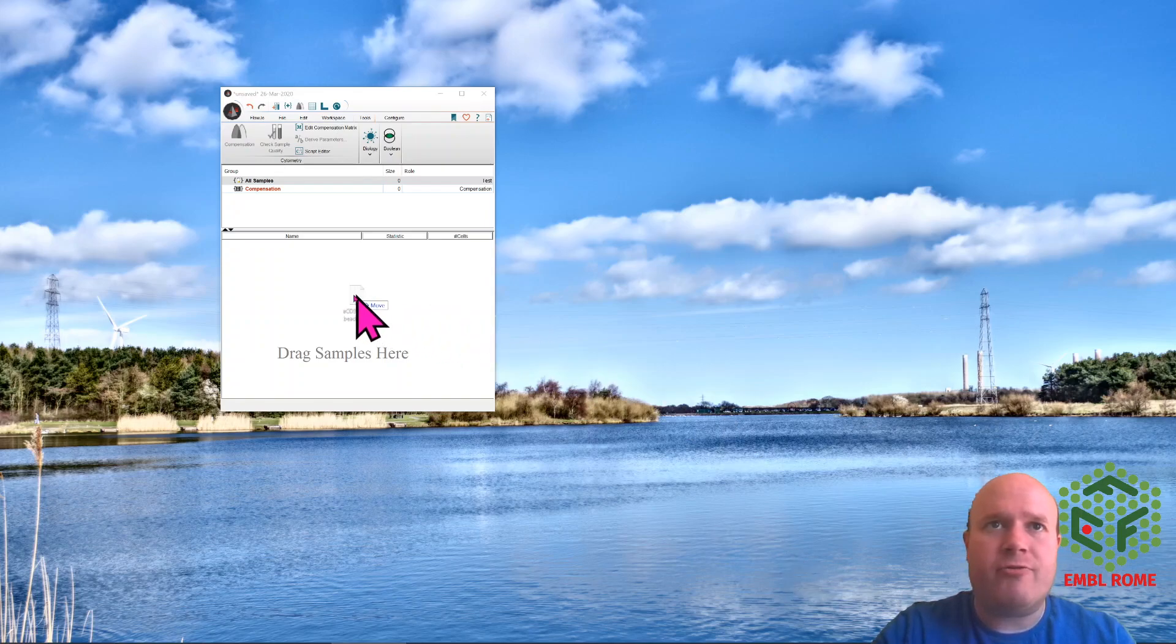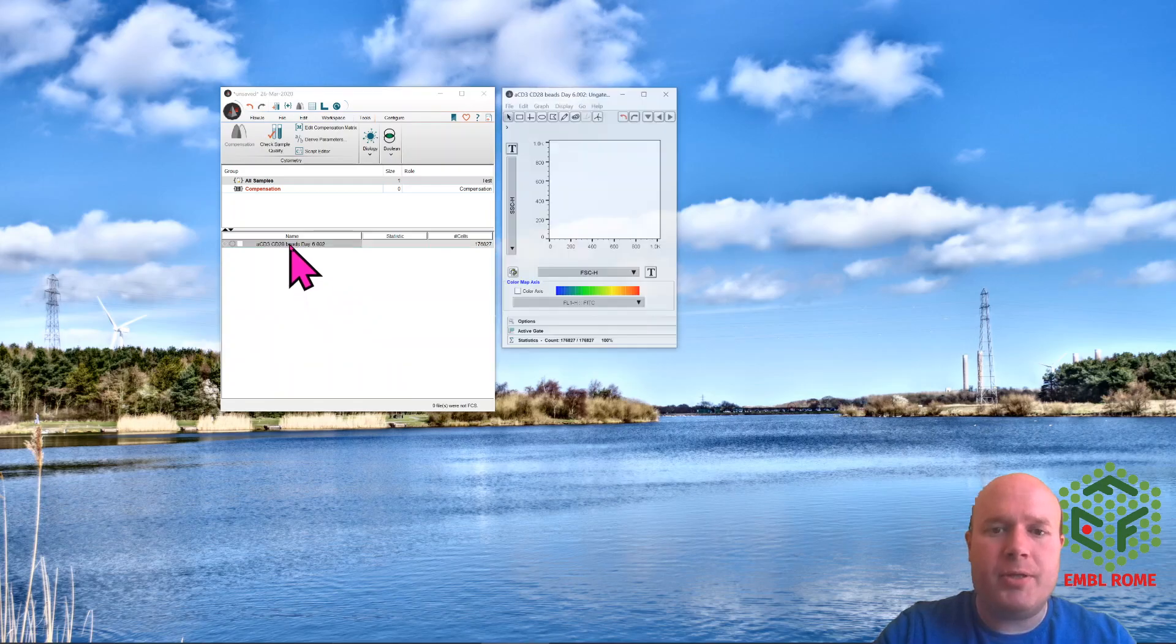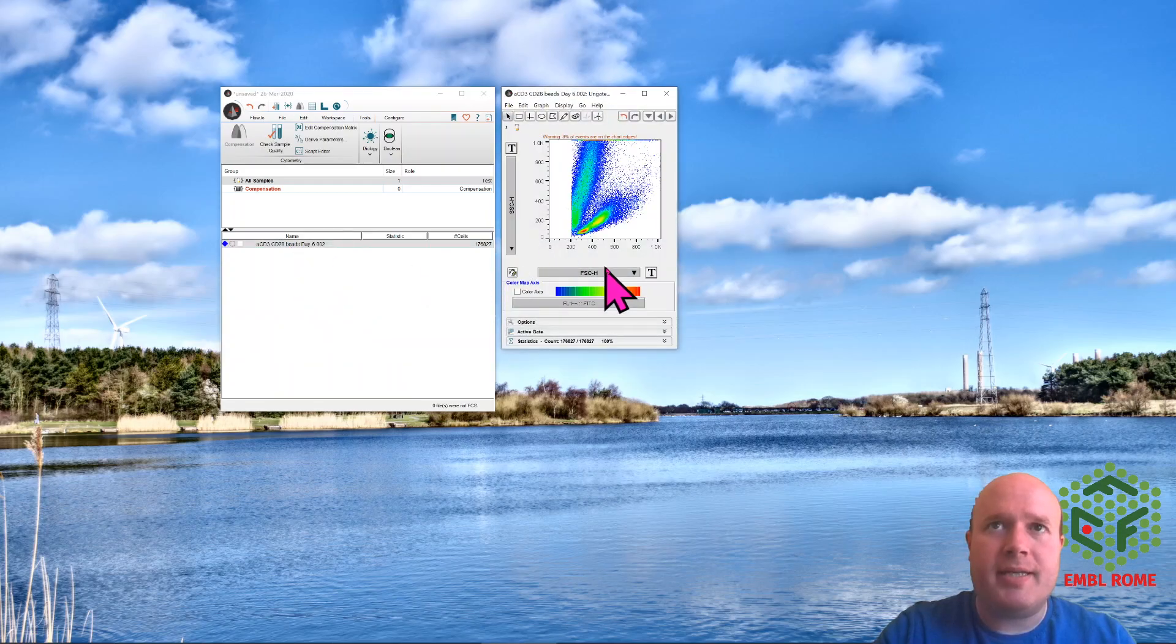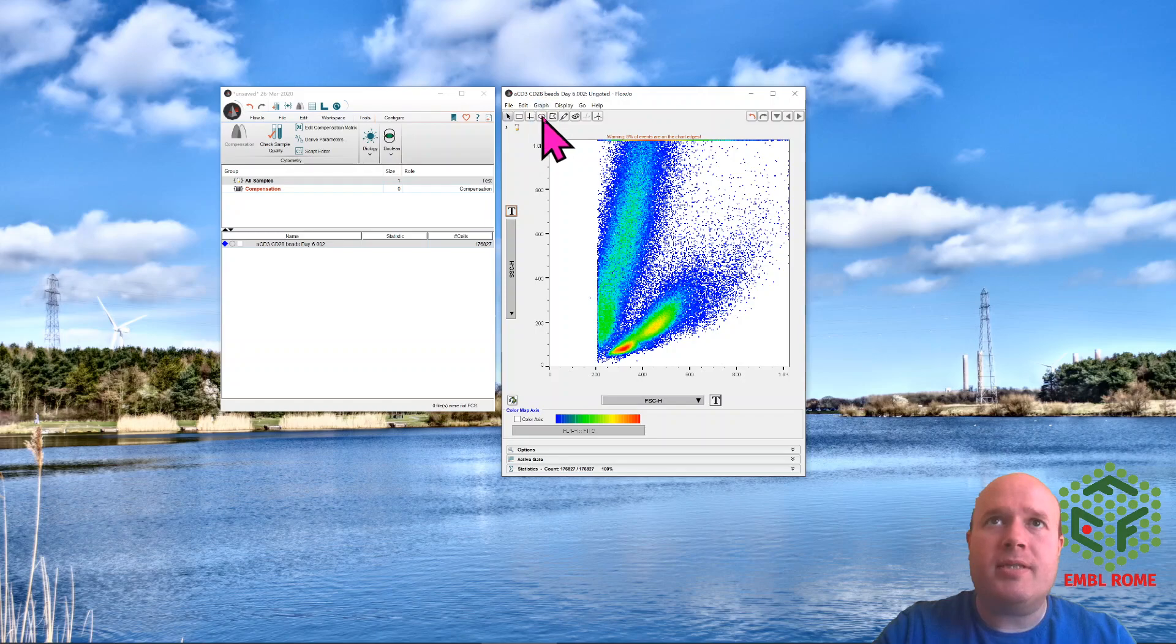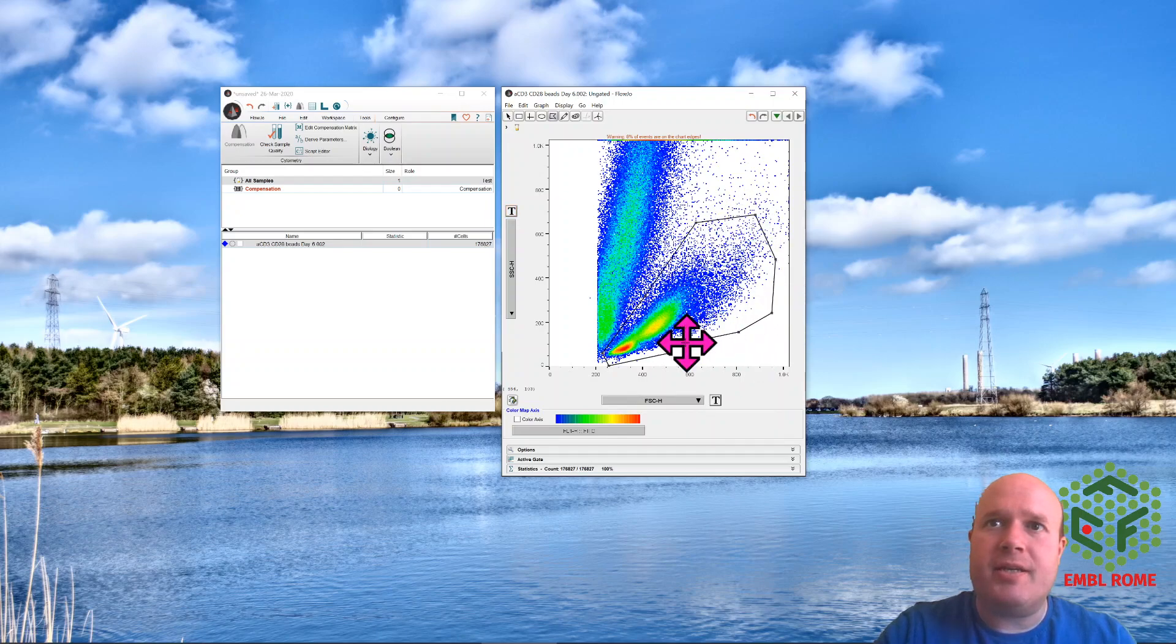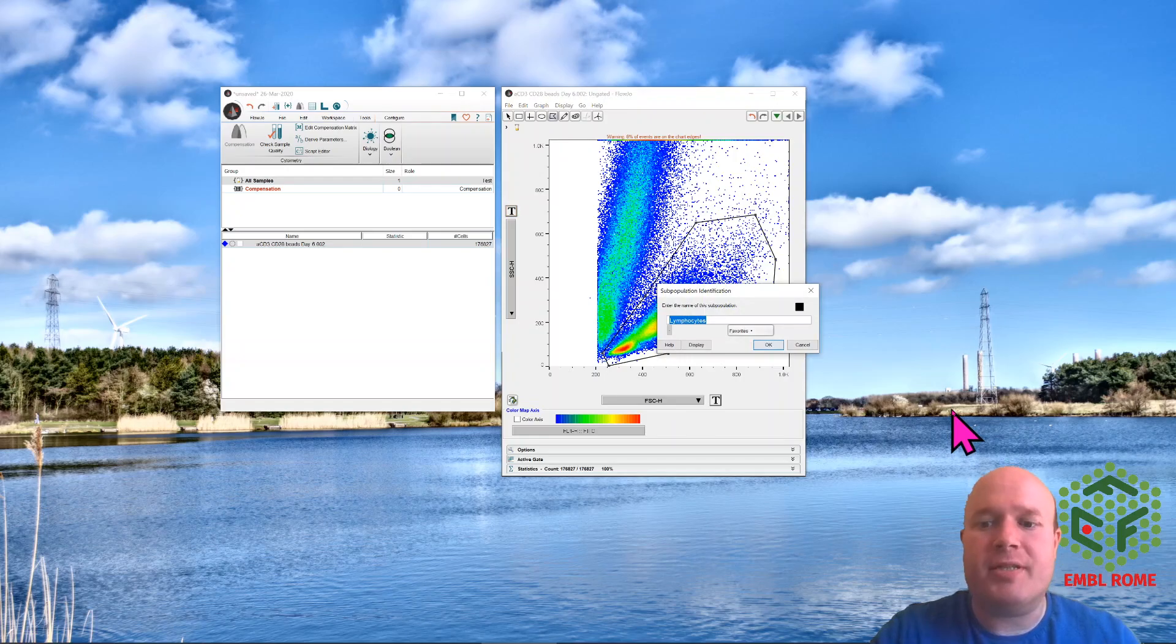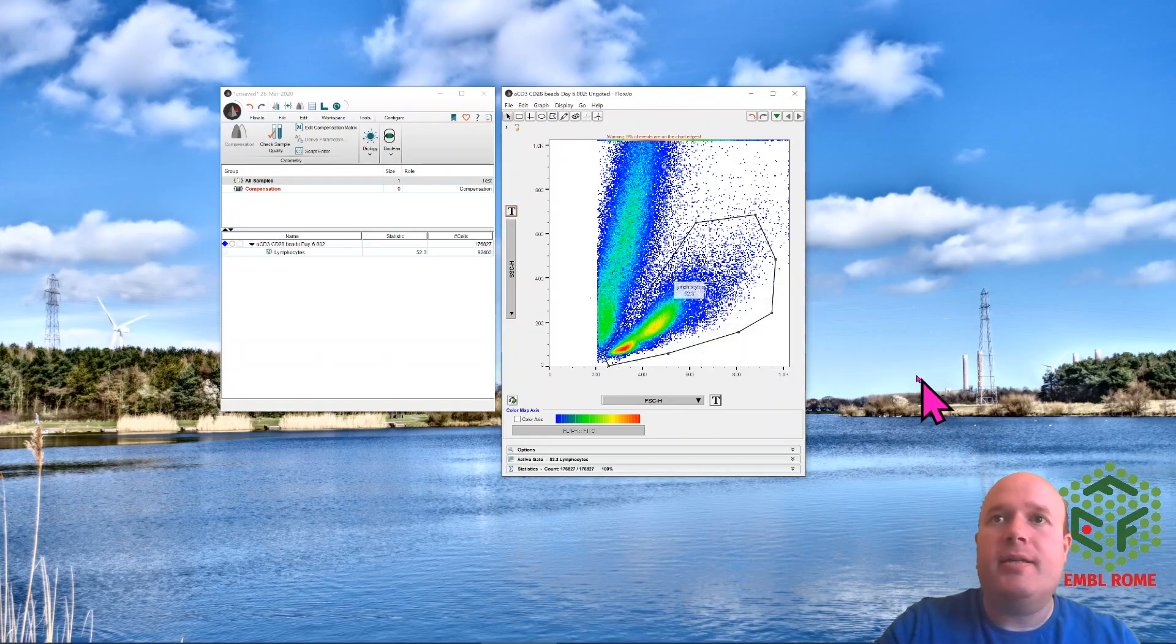You take your proliferation data, drag it into FlowJo and do your usual gating. So in this case I'm just going to gate these proliferating T cells. Remember proliferating cells will change their forward and size characteristics to what you would normally expect because they're getting larger and they're more granular.